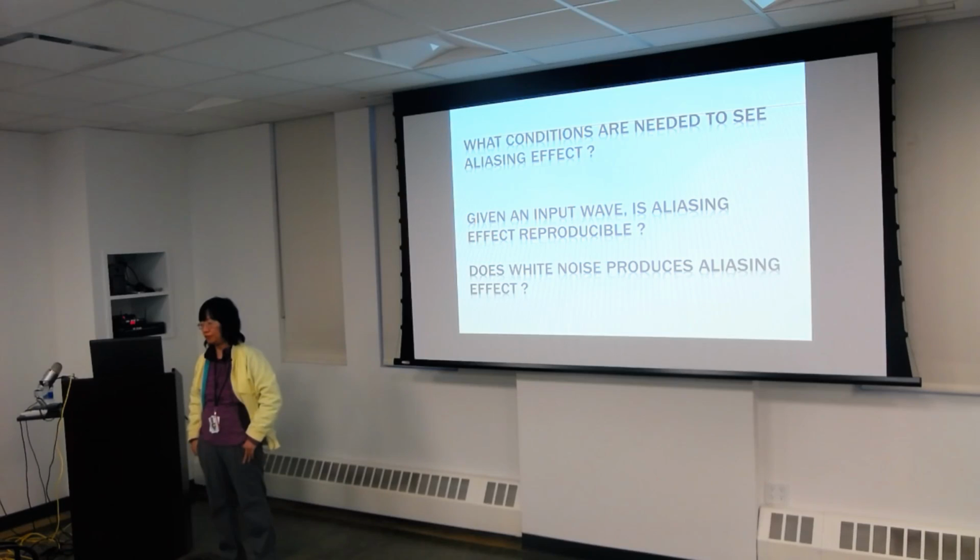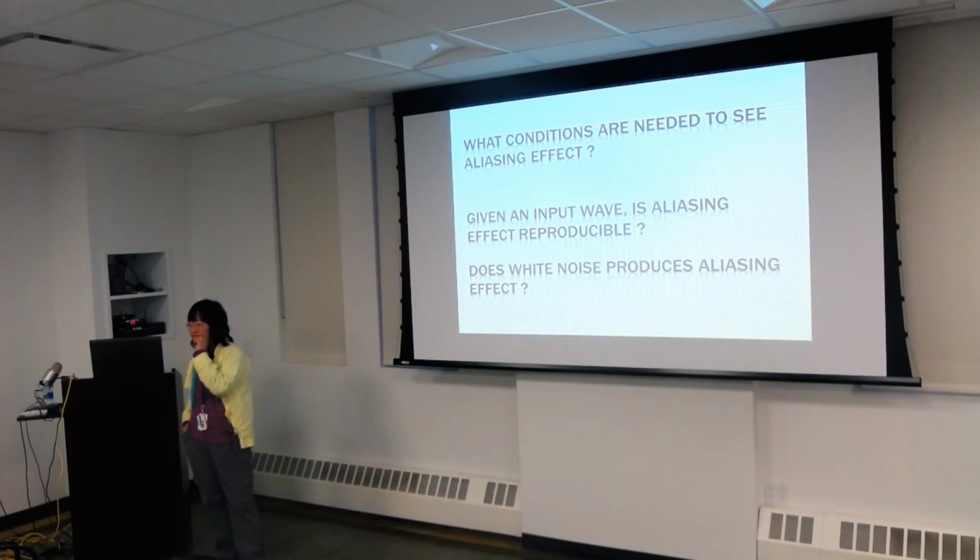But I think that's the issue in general: you can't subtract noise if you can't distinguish between the real signal and the background noise. In general, you have to distinguish your noise and your signal. You always select the background that is being subtracted from your particle contrast, at least that's my understanding. So anything that's part of the background, like white noise, should be subtracted from the data that you would use to do a reconstruction later on. I think, if the noise is actually constant.